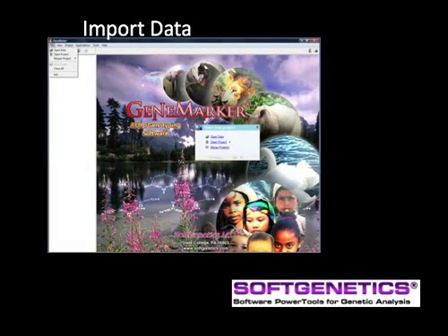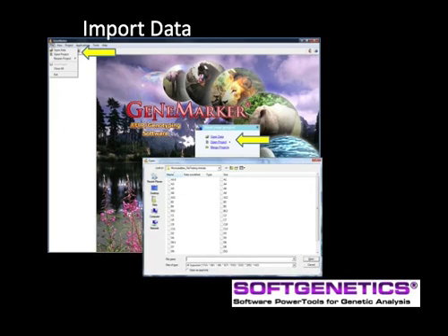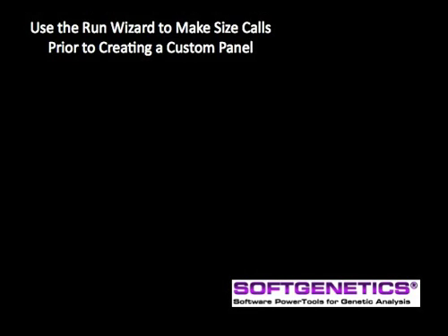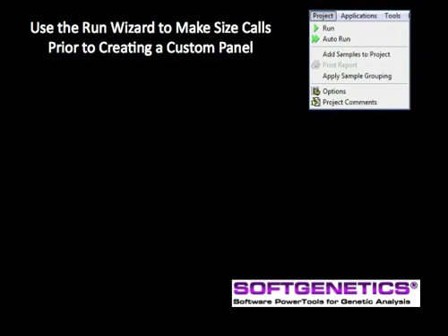As a quick review from the introductory tutorial, data is imported using the File drop-down or the Open Data Start Project menu, then clicking OK. The main analysis screen contains a list of data files, the electropherogram of selected files, and a synthetic gel image. Please view the introductory GeneMarker webinar for details regarding linked navigation, zooming in and out, the all-color browser, and viewing individual dye channels. A three-page run wizard is used to make size calls and to save run parameters in a template for routine analysis of similar data sets. Activate the run wizard from the Project drop-down menu by selecting Run.